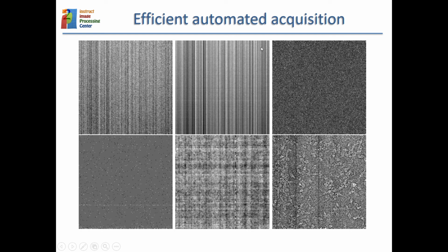The remainder should be 1, or small fluctuations around 1. In the case that you have not corrected correctly for the gain, then you see your particles in the residual image. So if you see your particles, that means that the gain has not been correctly compensated.